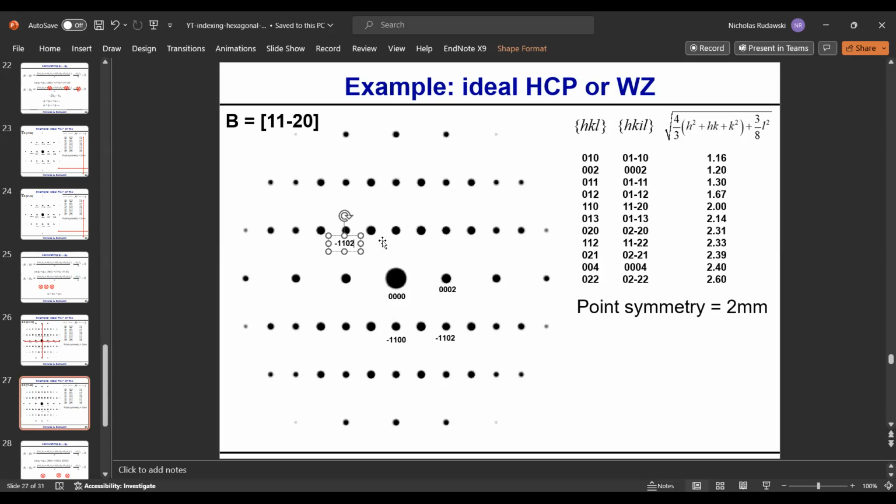I'll just do these closest ones here. This is where the bars are helpful because they're a little more compact. But yeah, you're nuts if you think I'm going to draw all those bars on there. I mean, ooh, take a long time to do that. Okay, 1 there.